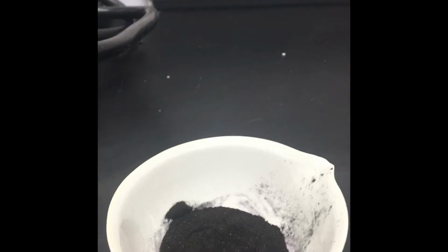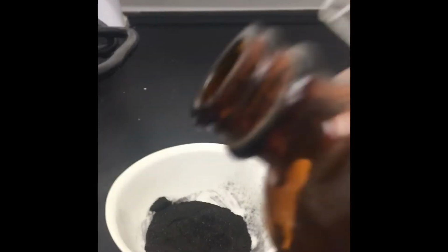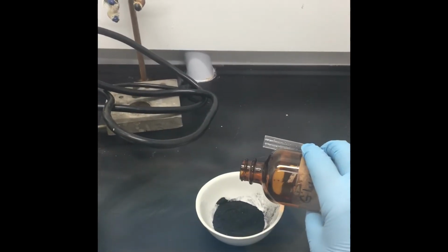It's a very thick liquid, very viscous, that's what we said. And this is actually going to cause a certain reaction. Potassium permanganate has a lot of oxygen, and glycerol has carbon, hydrogen, and oxygen. So let me get out of the hood and let's see what happens.